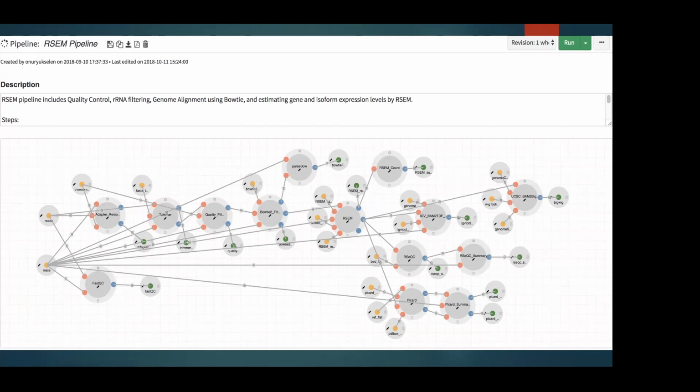But then they realized that, hey, we need to do this again with different tissue. We need to collect samples from kidney or from liver. So they sent new people to the mountain and they collected some other samples and brought them back. Can you do exactly the same analysis?